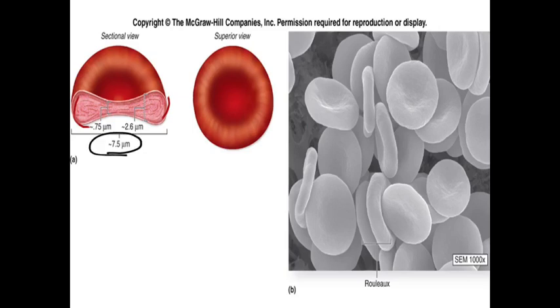That measure is really a nice indicator when you're looking at a tissue through the microscope and there's any blood in that histological image. It's basically like having a little ruler right there in your microscope. You know that that is about 7.5 micrometers across. So that's a nice measurement, one I want you to know.